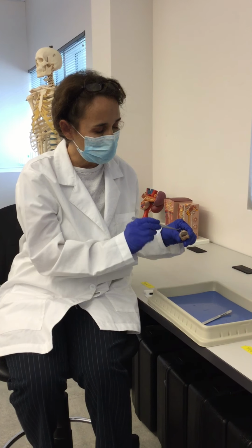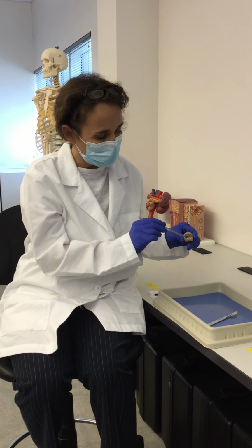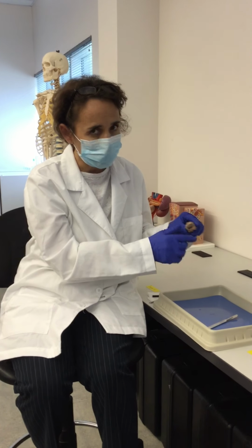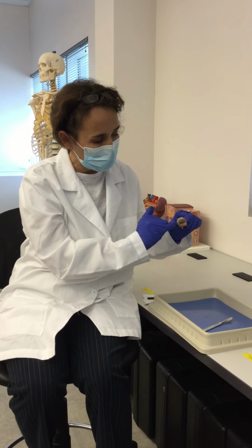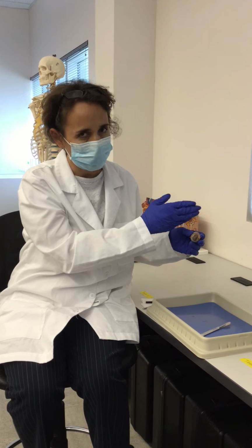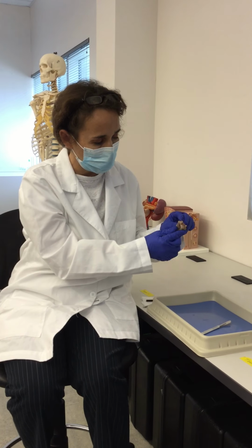It is white in color, and it surrounds this epithelium that is called the cornea. Now, in this eyeball, we are going to do a coronal or frontal section that follows basically the alignment of the cornea, because we can do also a mid-sagittal section, but it is as shown in the instructions for the lab manual that it is done in this way.